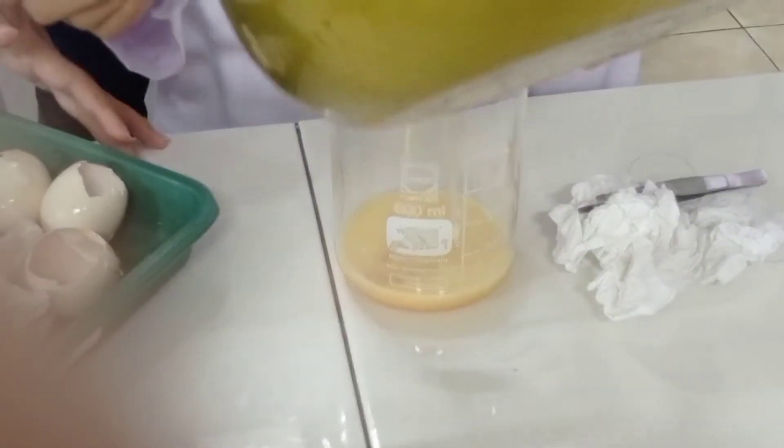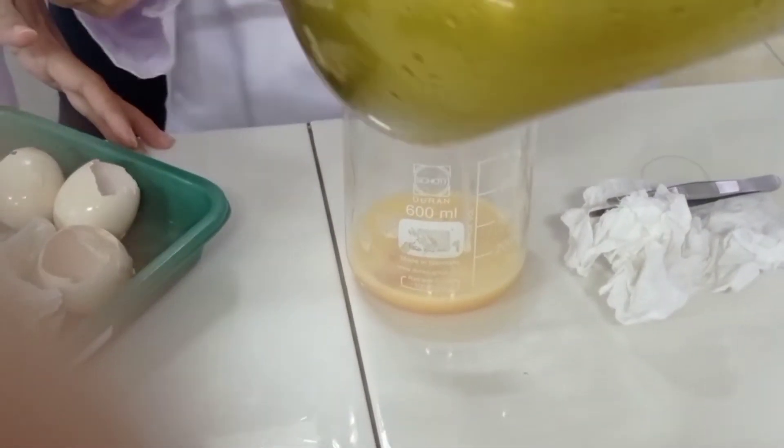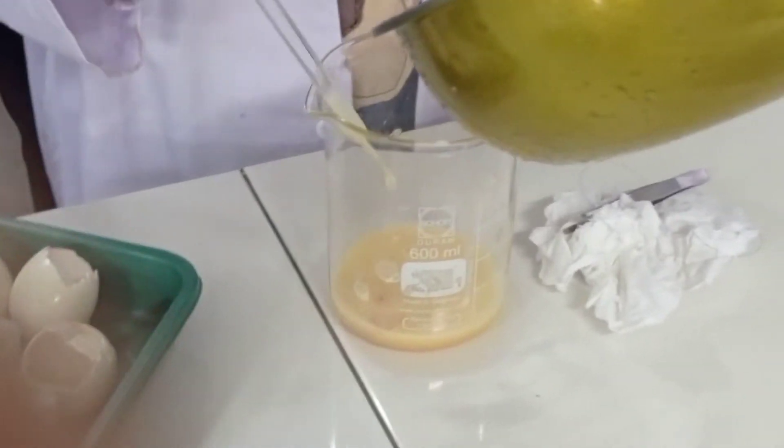Langkah keempat, yaitu membersihkan kuning dan putih telur dari sel-sel dan jaringan di sekitar embryo menggunakan pipet.